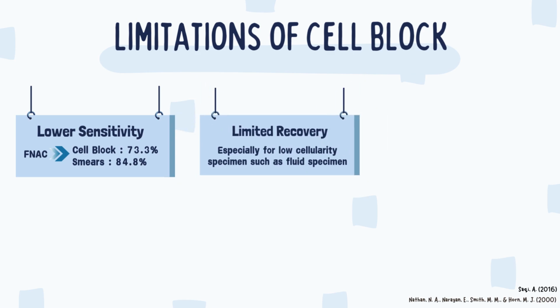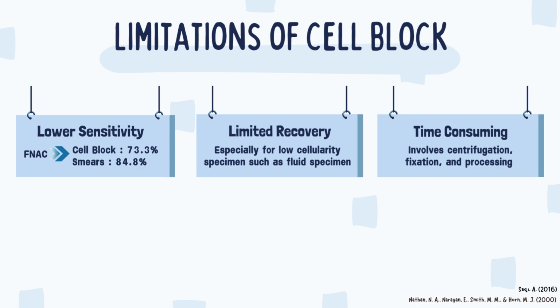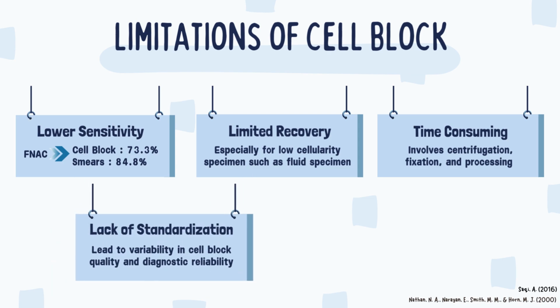Next, limited recovery in some specimens. It may not effectively concentrate cells, especially in specimens with low cellularity like fluid specimens, making it difficult to prepare effective cell blocks and potentially compromising diagnostic accuracy. Moreover, time-consuming, as it involves centrifugation, fixation, and processing, which may require more time and resources compared to simpler smear preparation.